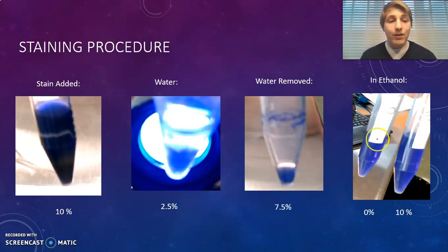So I wanted to look at absorbance in my case because that is a really good marker for how much biofilm is being produced, because the more biofilm there is, the more absorbance that I will read because there'll be more stain present in the sample.